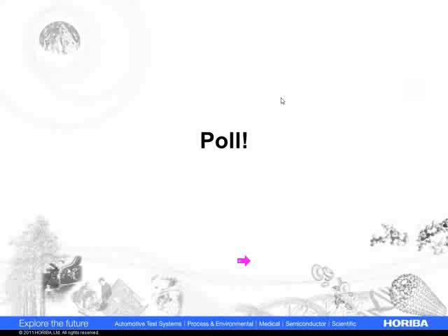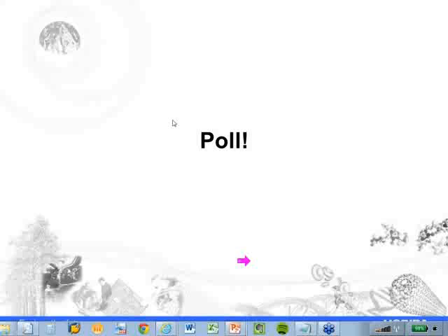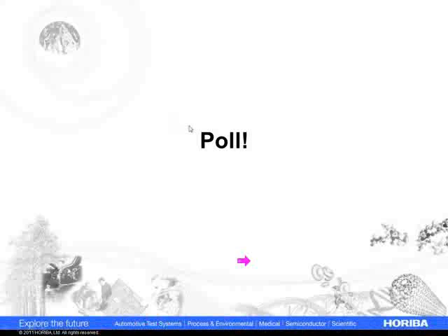Milda or Mita is saying that they assume that their particles are round. That's very interesting. And whenever we get sample submissions into our lab here in Irvine, I never ask my chemists to assume anything about the sample.